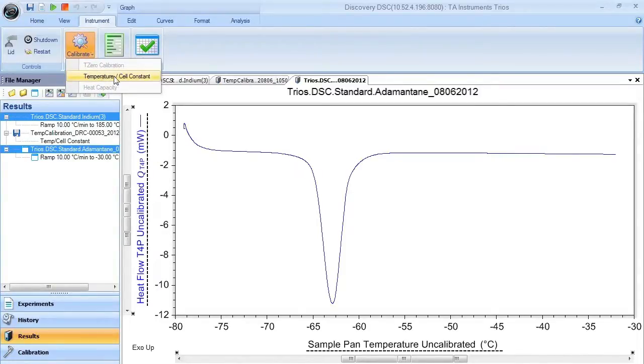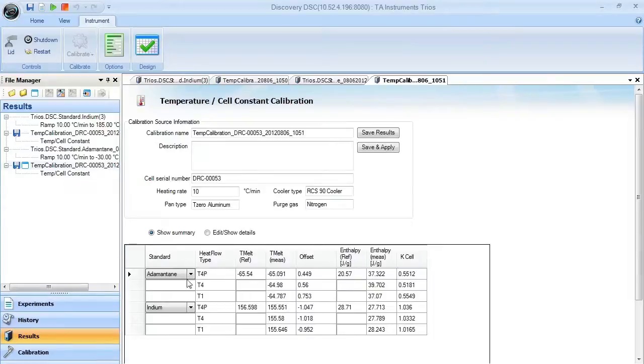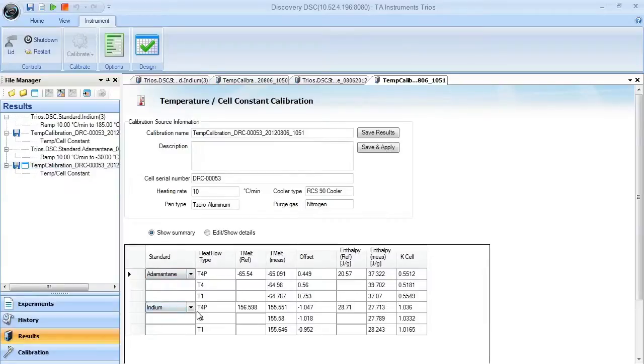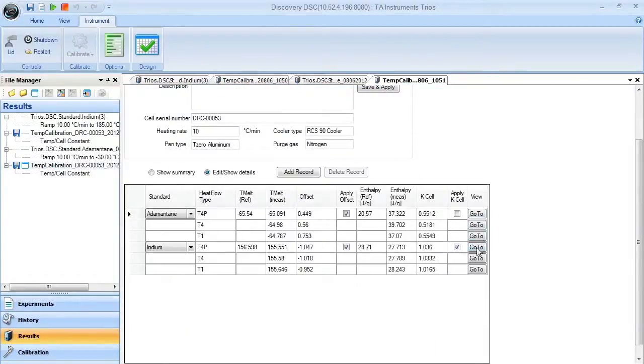You can select temperature cell constant calibration, and you can see you get another analysis menu here, which shows you how the results were analyzed for both adamantine and indium. If you'd like to see the data sets and how the software analyzes these, you just hit Edit Show Details, and you can go to the various items that have been analyzed.